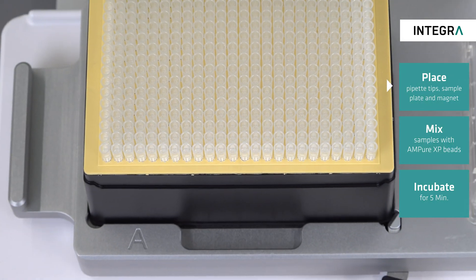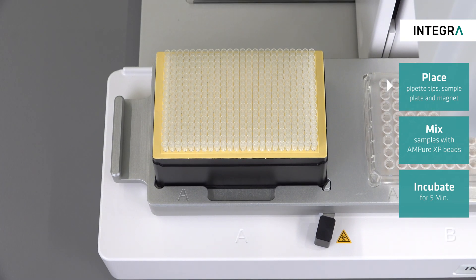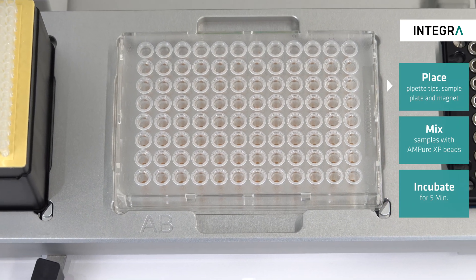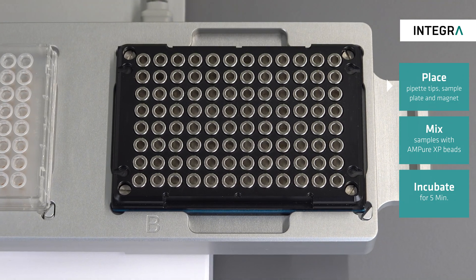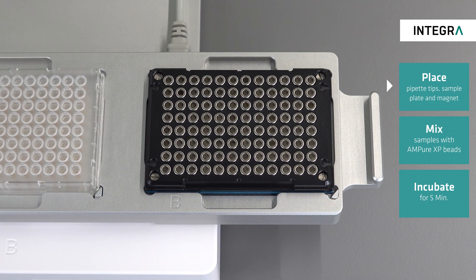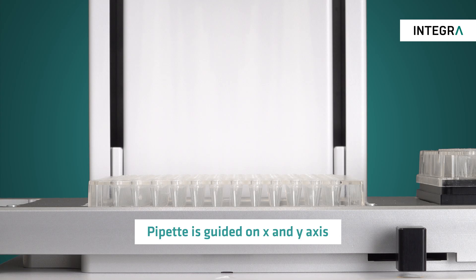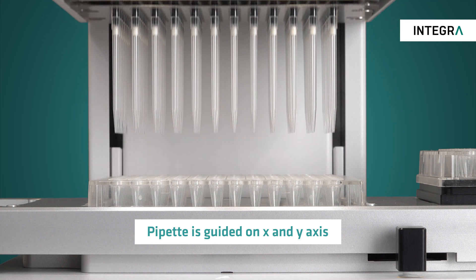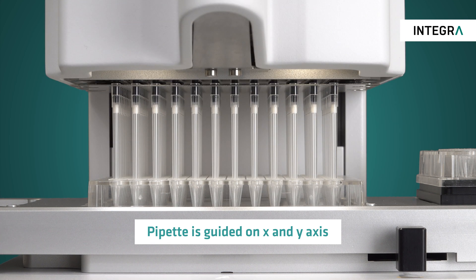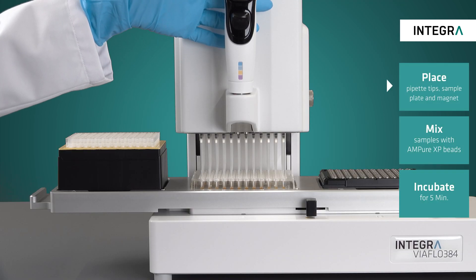The setup should look like this. The left position or A should have grip tips. The middle position or AB has the 96-well plate with beads loaded, and the right position or B has the magnet. The screen tells the user what the next step is, so all that's needed is for the user to move the instrument to the labware. There is no chance of crashing since the MPUXP program has already defined what the bottom of the specific labware is and the tips are always guided into the correct position.